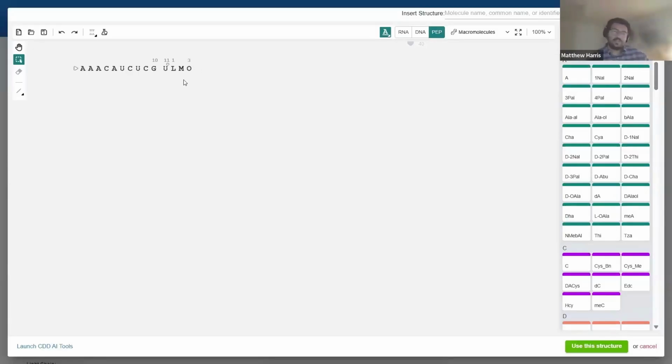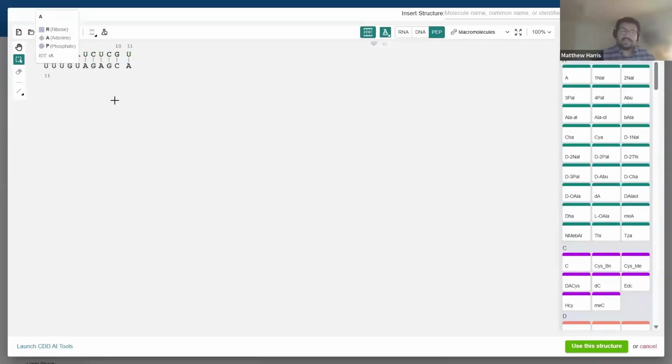Now, if we just remove these amino acid bases that we have here in our sequence, what we can also show is that if I select the highlight button again and highlight just a portion of my sequence here, I can now create an antisense strand with just what I've selected as the short sequence. I could have also done that with the back button, if I had selected the entire sequence and created an antisense strand from that as well. So it's very easy to start adding these into your growing sequence.